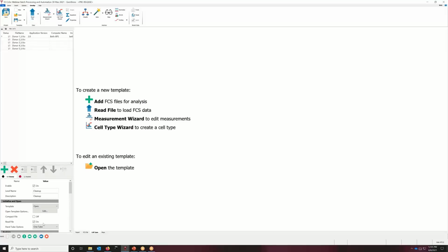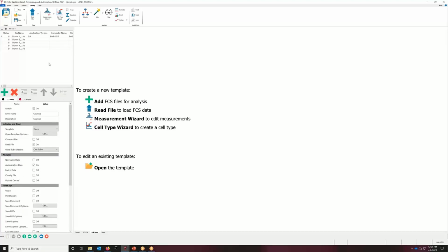And it also exposes the batch commands, which are down here at the bottom. I'm going to open these up a little bit more so we can see them all. Now, the purpose of these different modes is so that you can run the program in compliance mode using user permissions, so effectively you can lock down the program if need be, or if you want to avoid making inadvertent changes to anything.